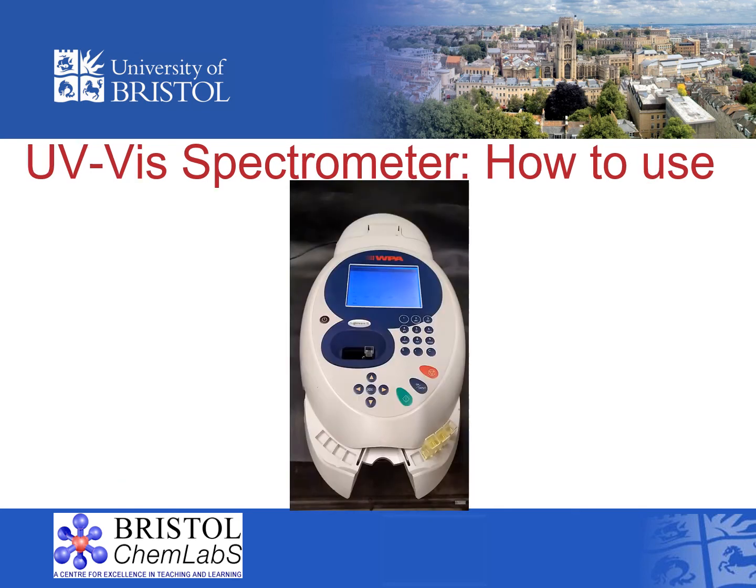In the following video, we show how to run 3 different concentrations of a yellow solution, which is a yellow food dye dissolved in water. Food dyes are generally complex conjugated molecules and therefore absorb strongly in the UV-Vis range.